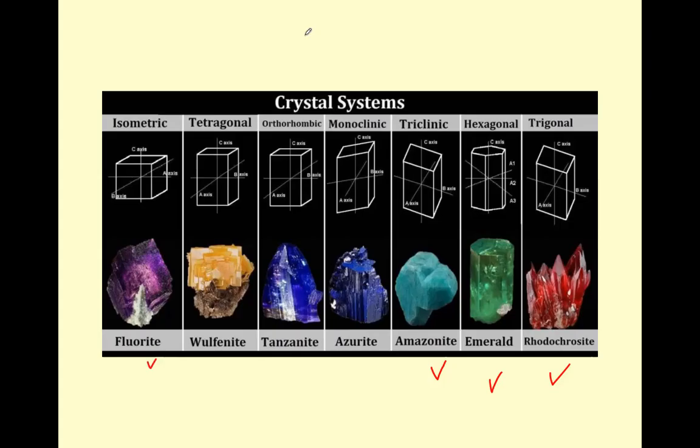Based on these features, your observations under the polarizing microscope will be different. That's why we are able to identify these minerals using the optical microscope. Sometimes we can identify them just by the plane polarized light, that means without the upper polarizer. But some minerals we cannot identify without the upper polarizer. You have to insert the upper polarizer and see those beautiful colors, I mean, not natural colors, but the vivid colors that you see. Based on that, you can decide what mineral it is. We will come to that later.